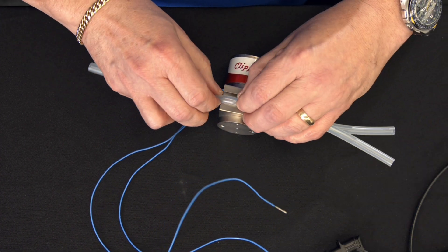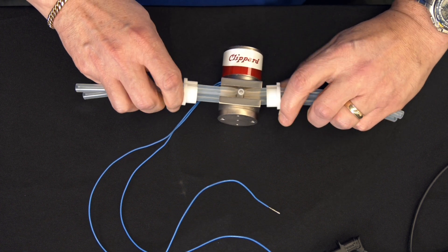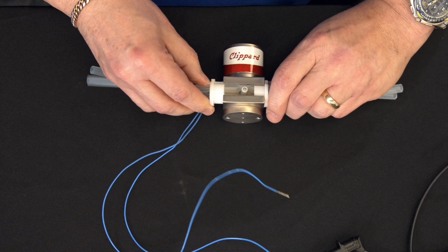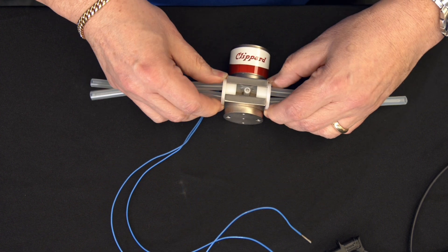De-energize the valve, slide the other tubing into its place, and then you can use these little guides that hold the tubing in place and just push them back into their original position. Just like that.